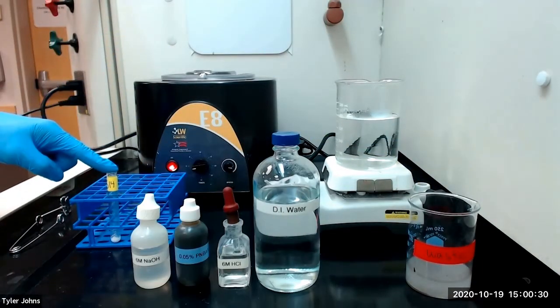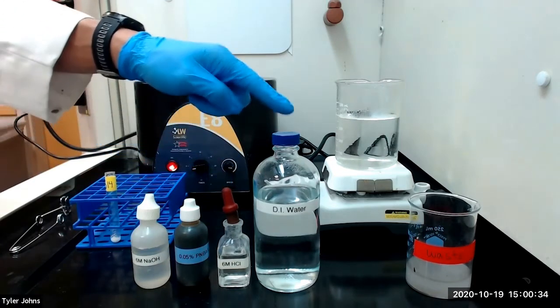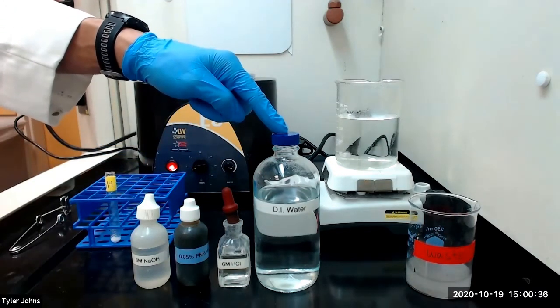We will next dissolve our precipitate by adding several drops of 6 molar hydrochloric acid and 1 milliliter of deionized water.